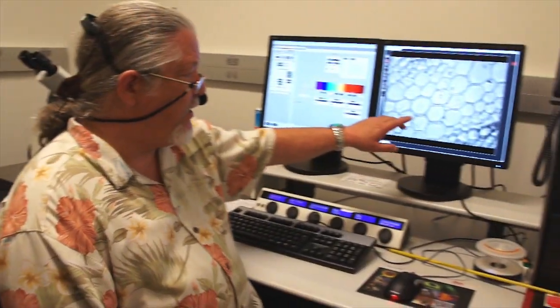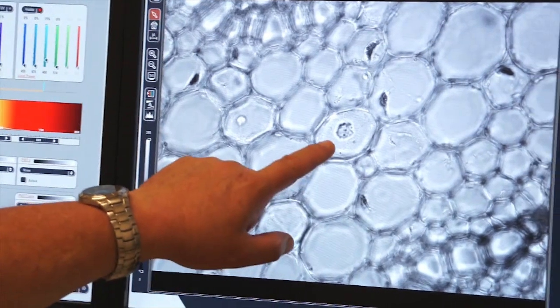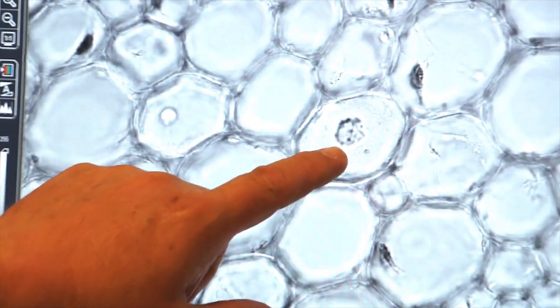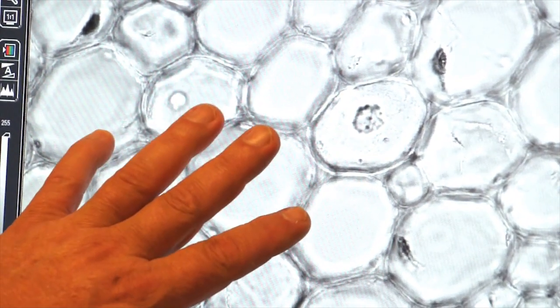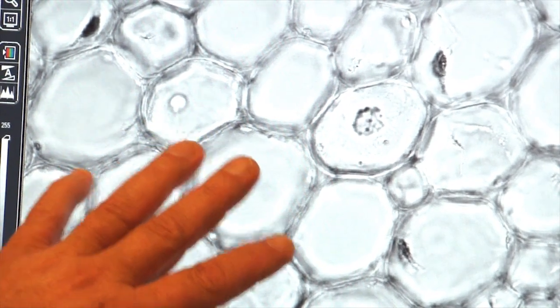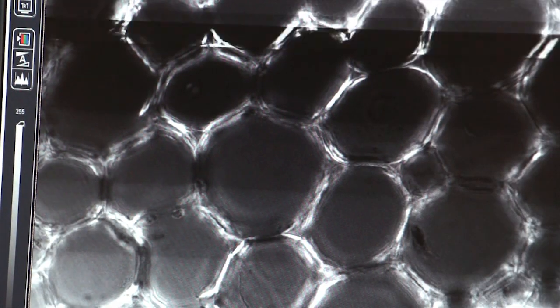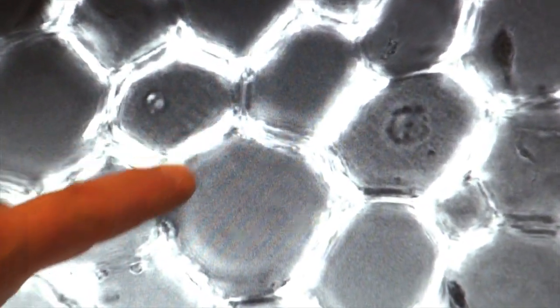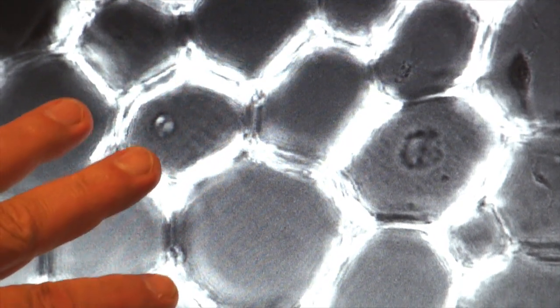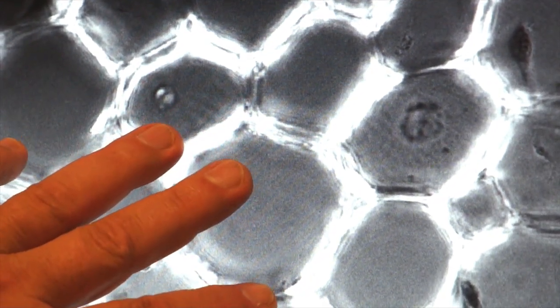Focusing on the monitor, you see a bright field image of a thin section of plant material. You can see the individual cells and, inside one cell, the nucleus. Bright field is fairly well illuminated but sometimes lacks as a contrast method. Switching to DIC — differential interference contrast — you can see a little more contrast in the cells. However, because of the polarized light nature of the cell walls, they glow highly in this slide. For live cells on coverslips or in a culture plate, DIC is often a better way of imaging in transmitted light.